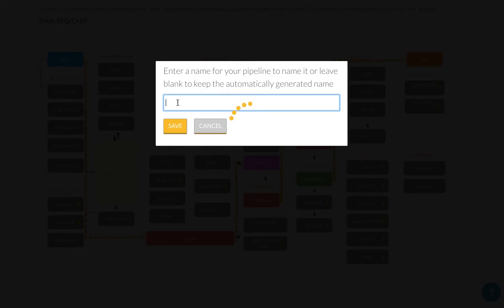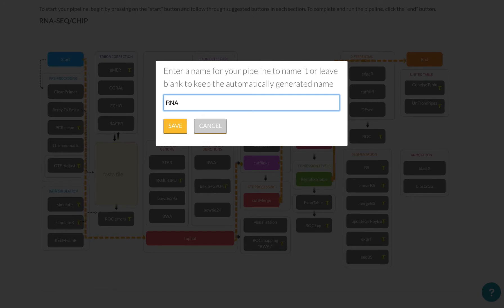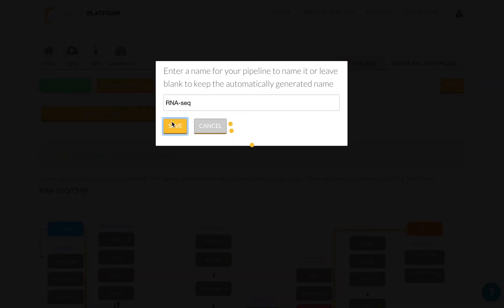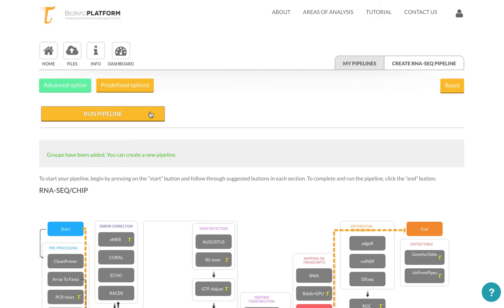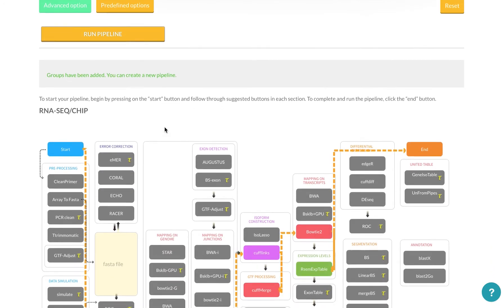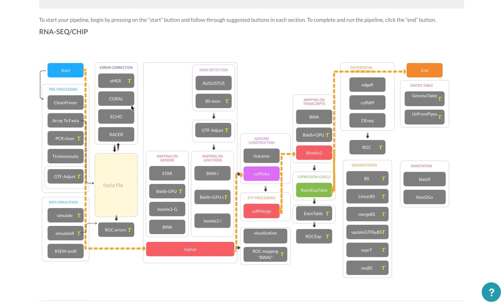And you can notice here, I have to click the run pipeline button. Now, don't forget to do this, but just let's go and look over here. You can see the pipeline that I've created. And now I can click this run pipeline button.